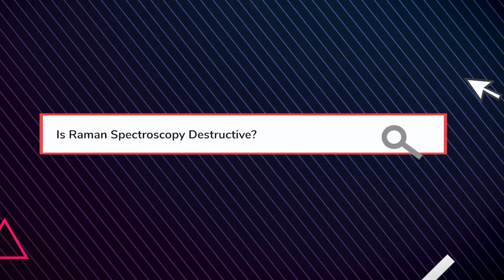Is Raman spectroscopy destructive? No, as a general rule. In some cases there are arguments that under long beam times with higher energy beams you can cause very minor structural deterioration of a sample, but as a general rule from most people's perspectives, Raman is not a destructive technique at all. It just uses effectively a visible laser light.